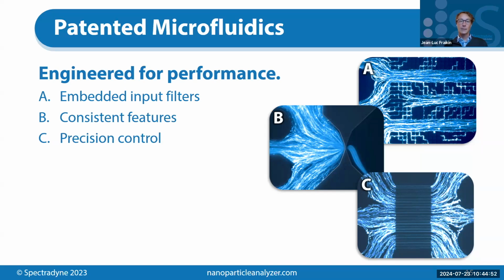Okay, and then the last question that I see in the chat right now is how do the fluorescence detection limits of ARC compare to those of other nanoscale flow cytometers? What is the minimum number of surface proteins that can be detected on an EV surface? Okay, that's a good question. So I don't have the data in this presentation, but it's available on our website where we used cross-calibrated beads to assess the detection limit of the ARC. They were assigned a brightness using MESF standards that are NIST traceable.